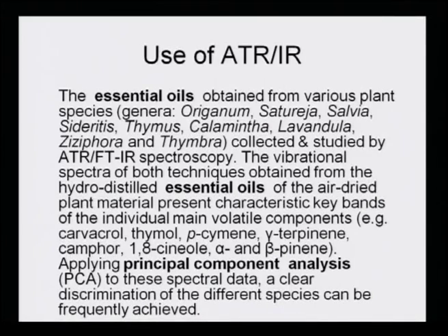Another very special technique which is used in the flavor and aroma analysis is described, the use of ATR and IR spectroscopy. The essential oils obtained from various plant species, particularly all those which are used for herbs, are collected and studied by ATR-FTIR spectroscopy, and these are origanum, satureja, salvia, sideritis, thymus, calamintha, lavandula, ziziphora and thymbra.